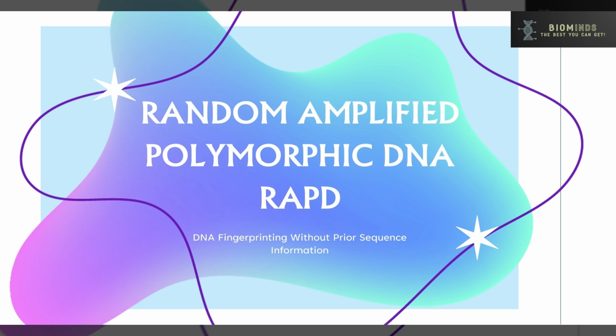In this lecture, we'll explore the principle behind RAPD, how the technique works step by step, its application in genetics and biotechnology, and the advantages and limitations you should know for exams and research. So let's dive into the fascinating world of DNA fingerprinting with RAPD. What if you could compare the DNA of two organisms without even knowing their DNA sequence? RAPD makes it possible, and in this lecture, you will learn exactly how.